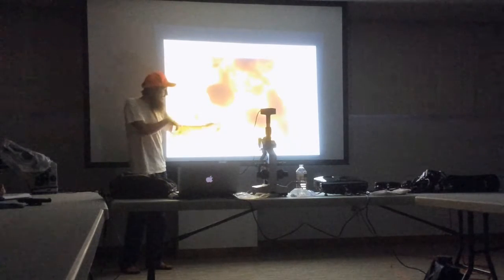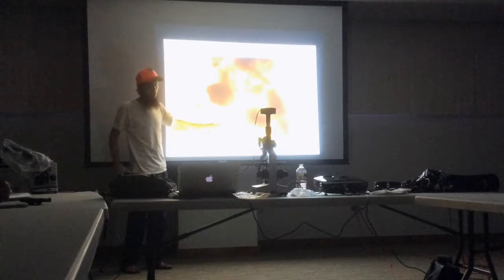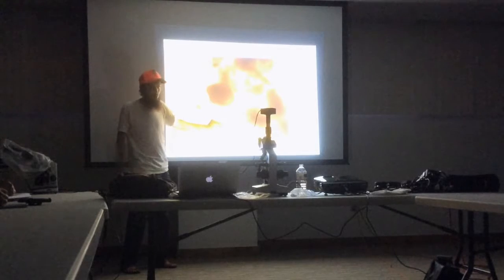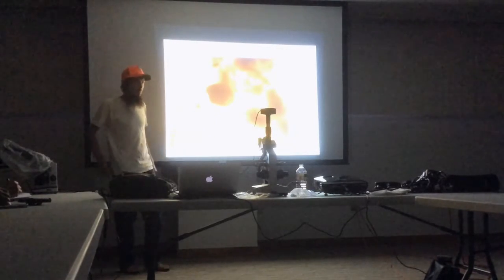So you use this tiny, like 1 bacteria, to get your scale, and then you measure to see that it's wide enough, right? If it was only half that size, I would say, oh, that's not a beneficial one, because I can see that all the way across.